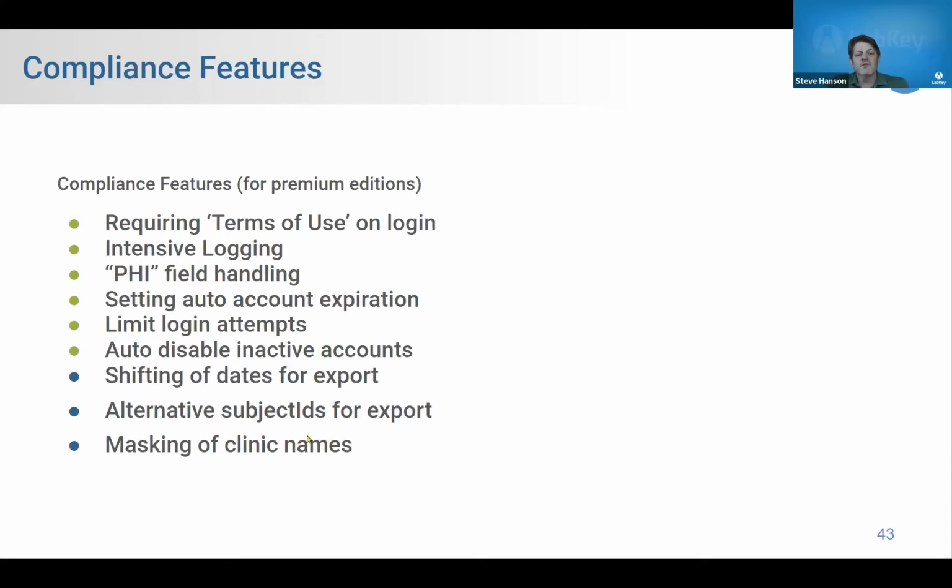And you can do all kinds of fancier things like set login attempt limits, and do other kinds of de-identifying things like shift dates, create alternative IDs, mask things like clinic names from being shown. Why mask clinic names?